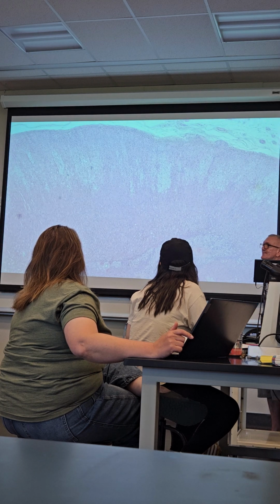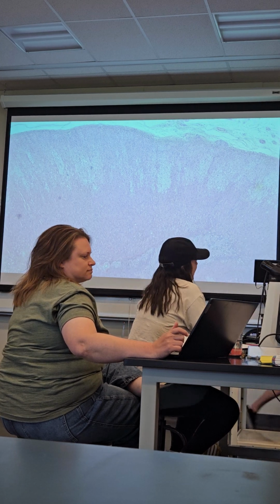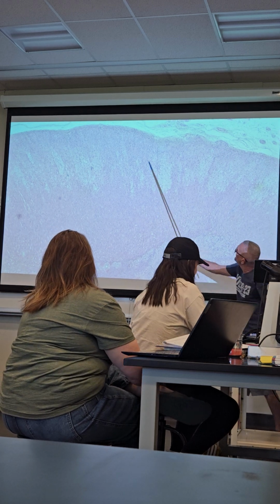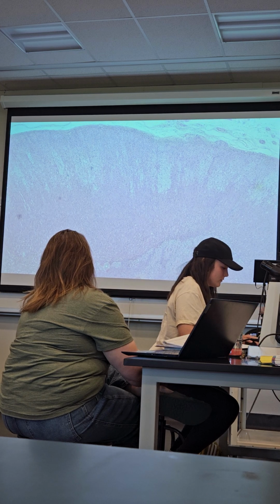What do we got here? Adrenal glands, yep. You have to know the three areas. The cortex, which is going to be from here all the way up. You have to know the medulla. I still need to know slides. Oftentimes you'll see large veins in the medulla.